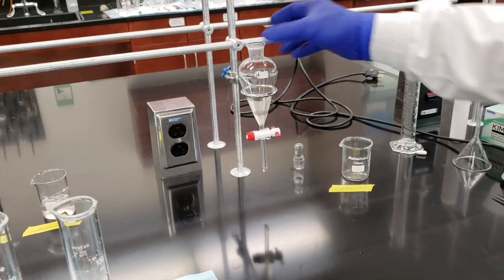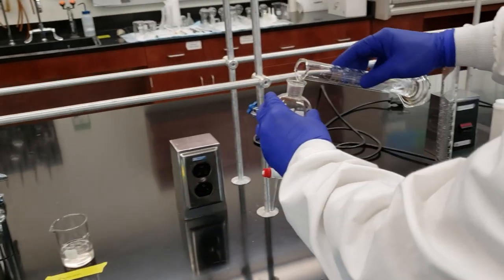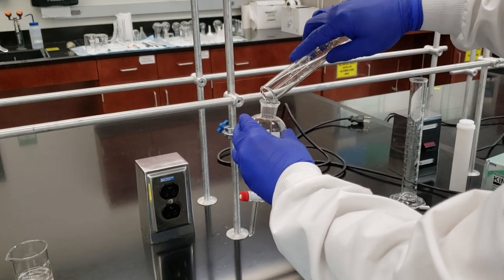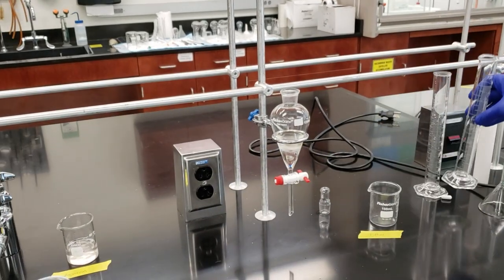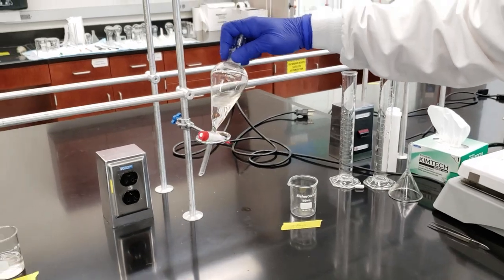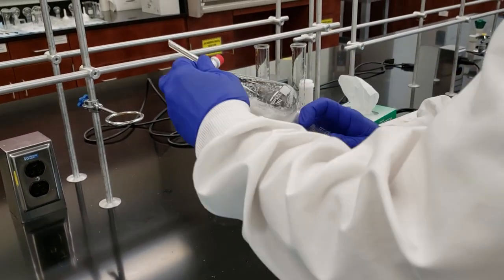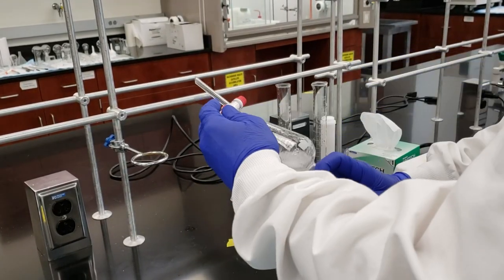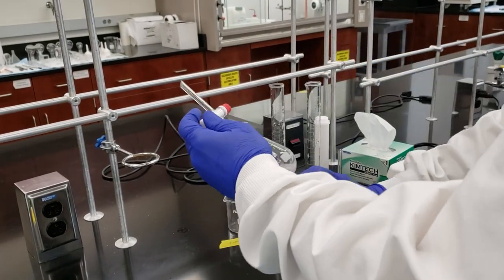We've got our ether layer still in our sep funnel, so we're going to add a second 15 mil portion of our 5% potassium hydroxide. This will be our second wash. So I'll set this over here. Put our stopper back in. Shake and vent. Shake and vent. And our third time.